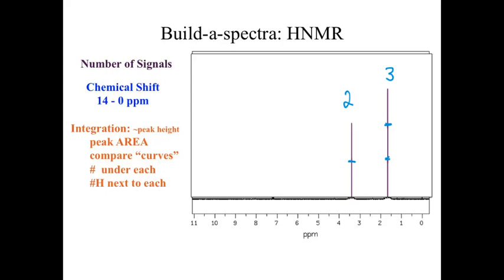Well, our signal at about 3 we said was a hydrogen bound to question mark, and we now know that there's at least 2 hydrogens in that signal, which means the easiest way to get 2 hydrogens chemically identical to each other is to connect them to the same atom. Okay? I've now drawn some information about that structure. What happens with our signal at 1.5 ppm?